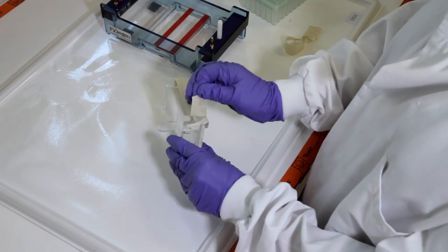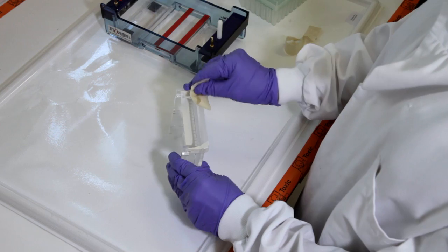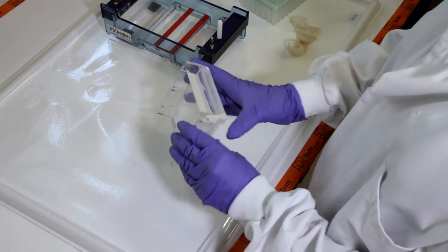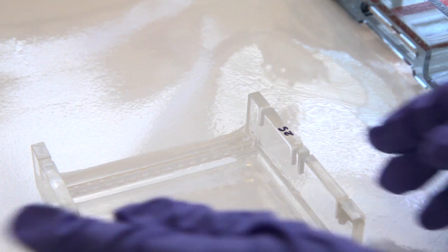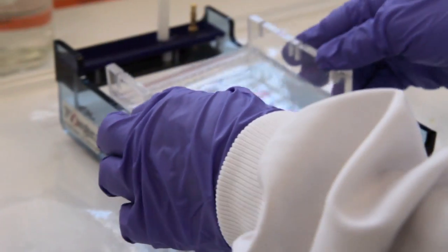It's easy to tell when the gel is set because it goes slightly opaque. You can then load the samples onto the gel. Firstly you need to remove the tape or sealing ends if you've used them from the gel tray. Place the gel still in the tray into the gel tank.